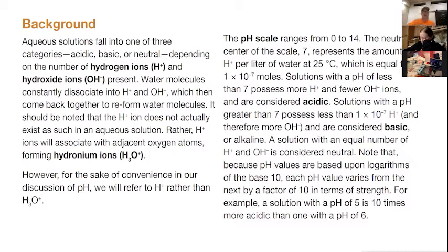So we know that acids produce hydrogen ions when they dissolve into water. We can also refer to them as hydronium ions, basically the same thing.